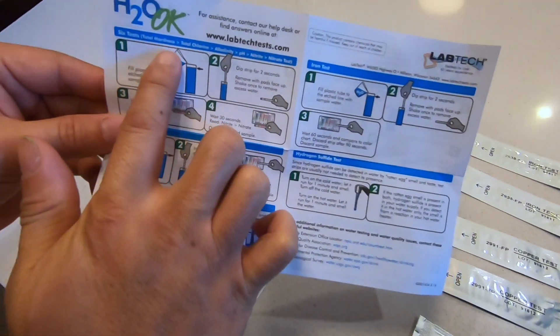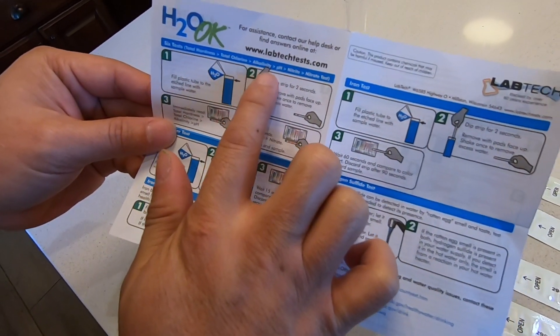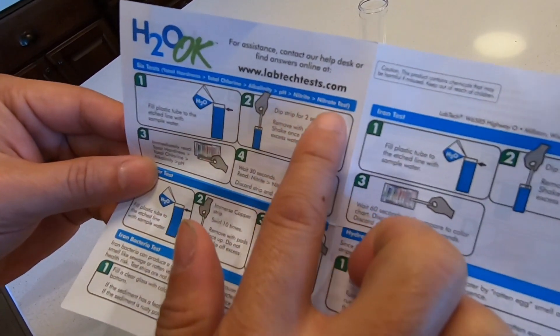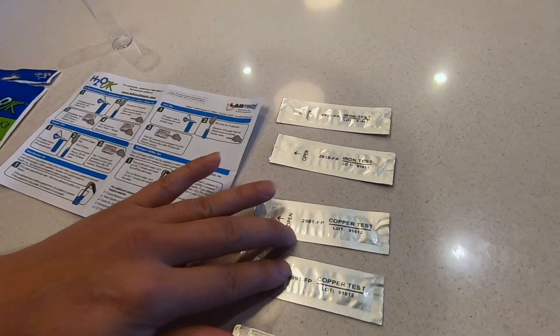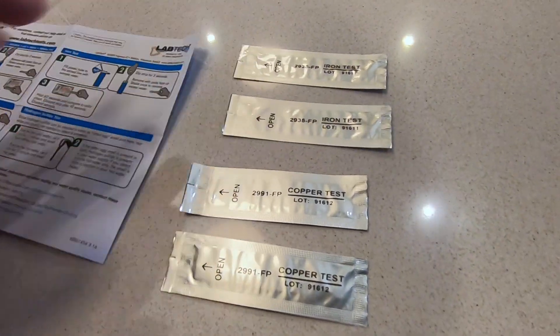It comes with two sets of six tests. The six test includes total hardness, total chlorine, alkalinity, pH, nitrite, nitrate, and then also the copper test. There's two copper tests and then two iron tests.